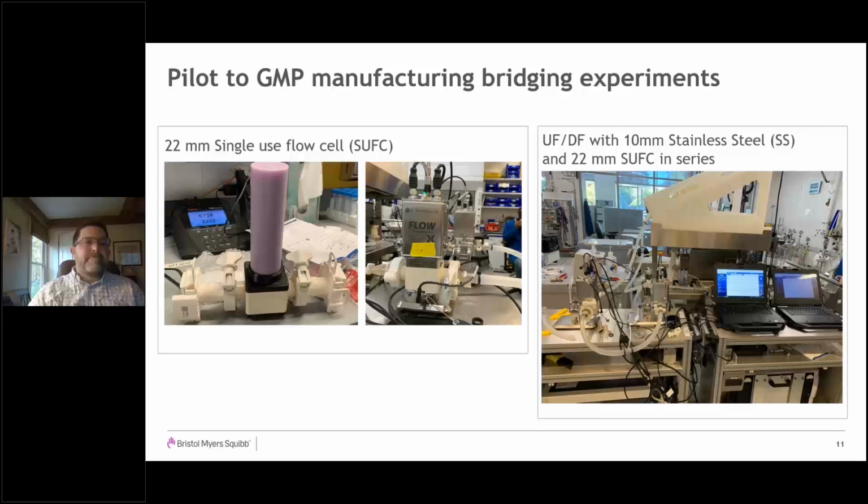And it's going to come, according to what I've been told by Repligen engineers, shrink wrapped in a box that you can basically pull off the shelf, connect it to your VPX, and start your manufacturing process and get accurate data. And so we have been doing some comparison studies, and I cannot reveal the results of those studies, except we've had some positive results, and that these things do exist, these single-use flow cells, and they work. But they are not commercially available as of right now, and I think the development is still being completed.